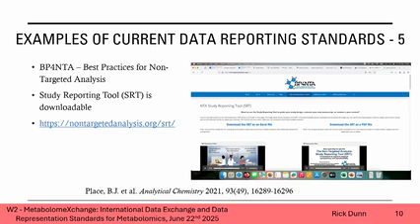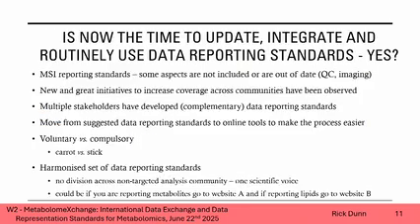All of these are different, okay, in the areas they cover, the areas of the process they cover, whether looking at targeted or untargeted data, etc. So overall, we're covering most of the bases, but I don't think one reporting standard covers everything at the moment.